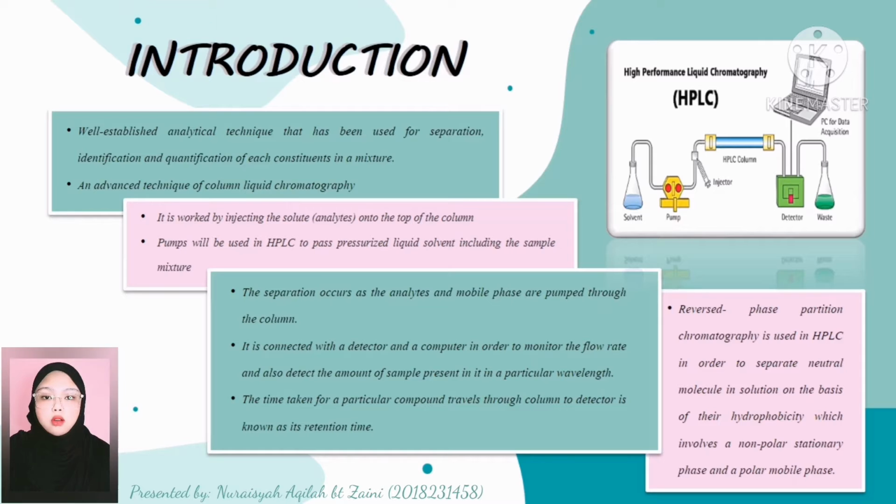High-performance liquid chromatography, also known as HPLC, is a popular analytical technique that has been used efficiently in separation, identification, and quantification of each constituent in a mixture. It is also known as an advanced technique of column liquid chromatography. HPLC is started by injecting the solute, which is the analyte, onto the top of the column.